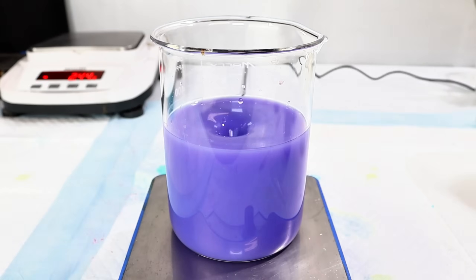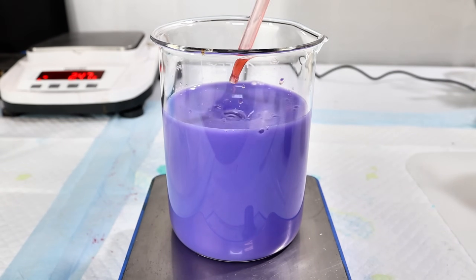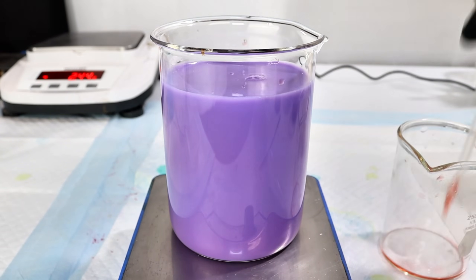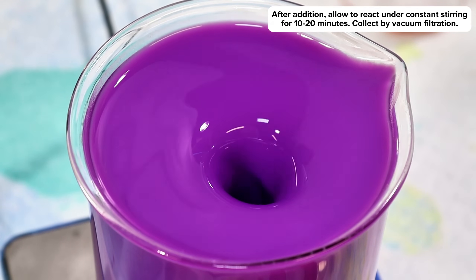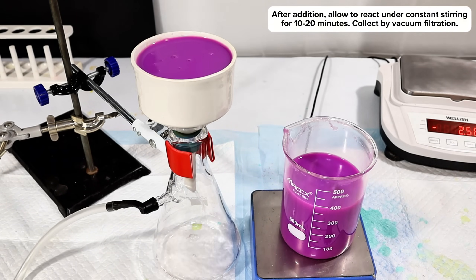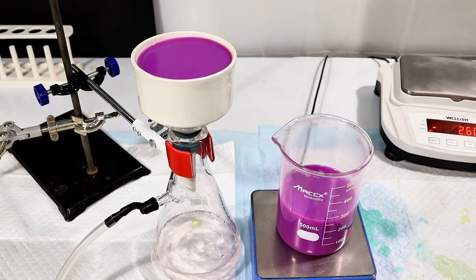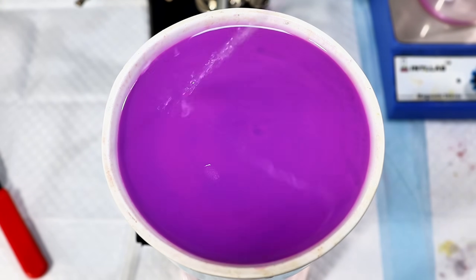This type of color shifting happens pretty often with cobalt compounds, and it's due to cobalt's tendency to interchange between tetrahedral and octahedral complexes. Once all the cobalt sulfate had been added, I allowed the mixture to continue reacting under constant stirring for a few minutes before passing the whole thing through my Buchner funnel. This collected my precipitated cobalt ammonium phosphate, while any unreacted reagents as well as the byproduct ammonium sulfate passed right through.